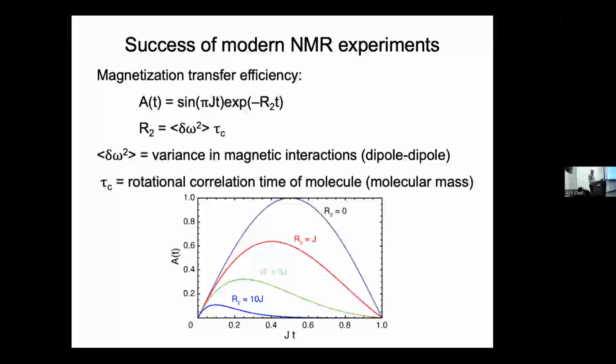And now the amide hydrogen to nitrogen scalar coupling in a protein is 93 hertz. So rather than being down here with the proton couplings, suddenly you're back up here somewhere, and experiments all work great. And then your boss keeps wanting you to work on bigger and bigger proteins.